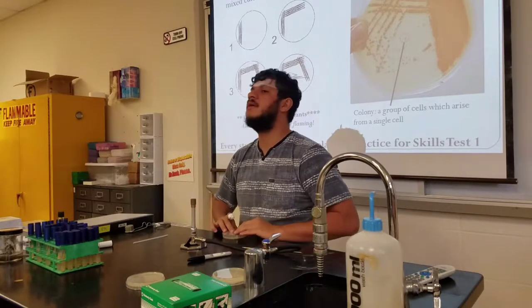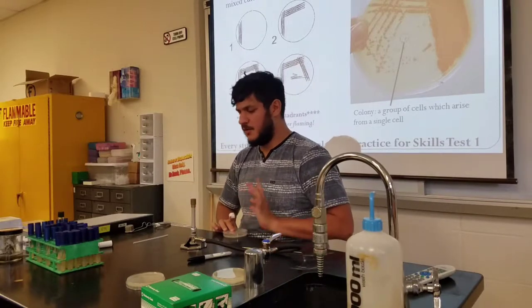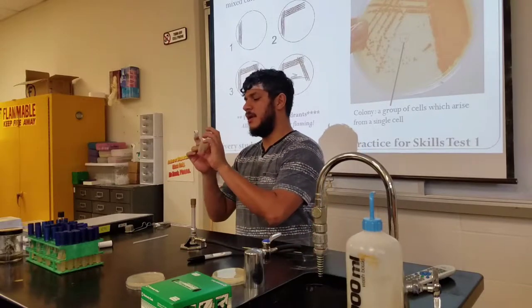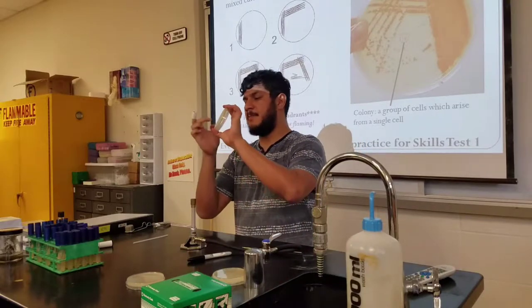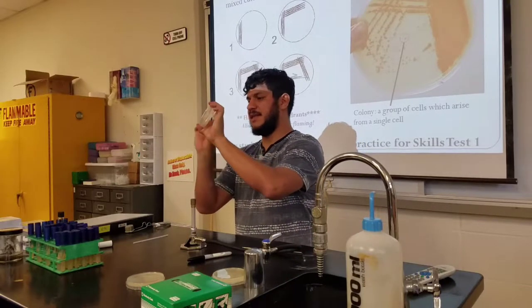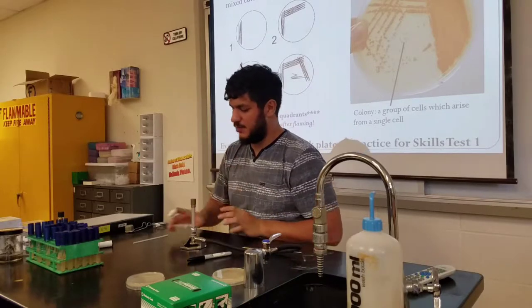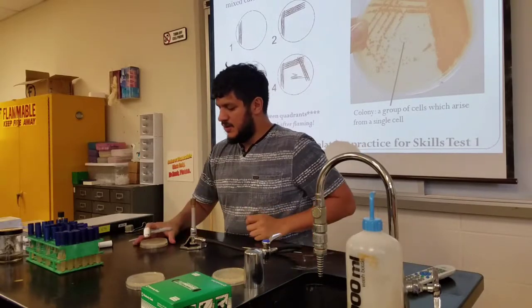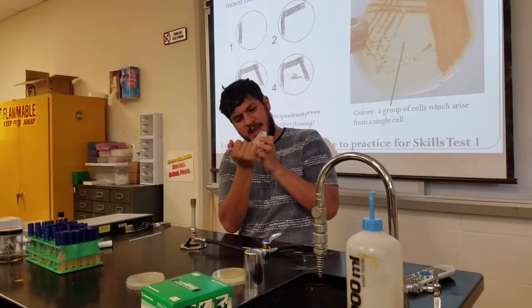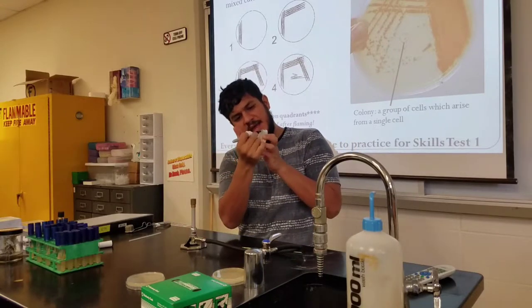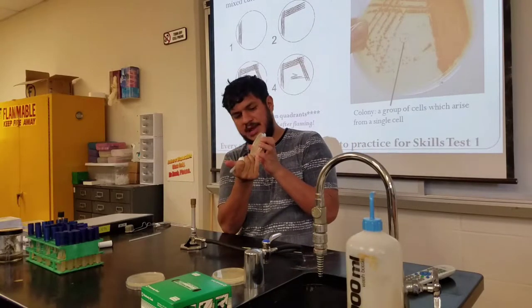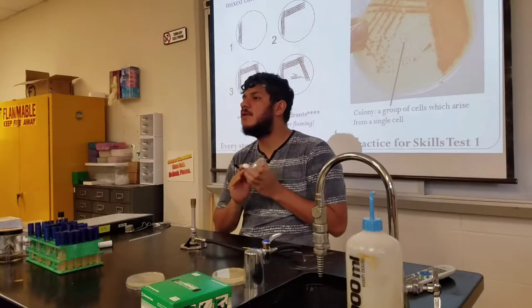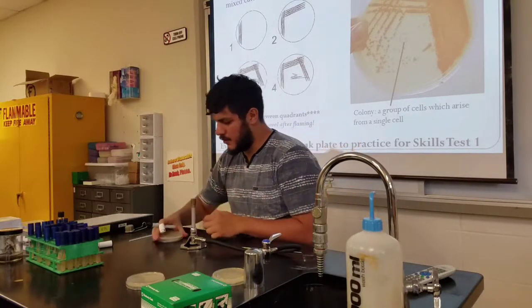Let me close it and put it down. First thing we also do is label. When we label the plate, we want it labeled on the bottom part of the plate, not the lid, and I will explain why later. I'm going to label on the edge around the plate so I don't block the view of my results with the microorganism.